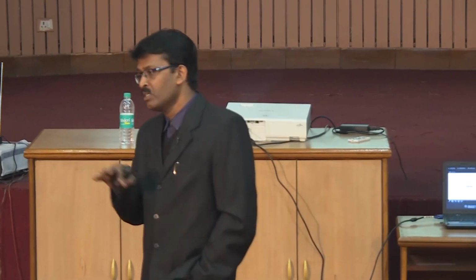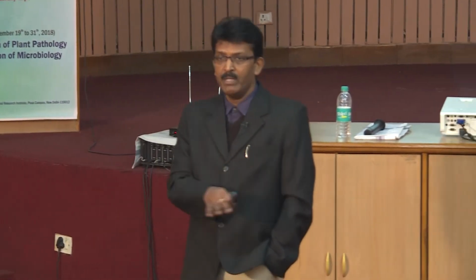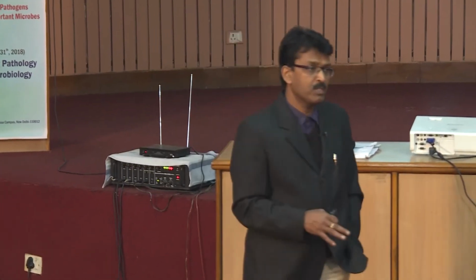All those things we will demonstrate in practical. So the primary purpose of this lecture is to let you know the fundamental differences between dye-based real-time PCR and probe-based real-time PCR, and the principle behind dye-based and probe-based real-time PCR. With that, we will stop the morning lecture today.